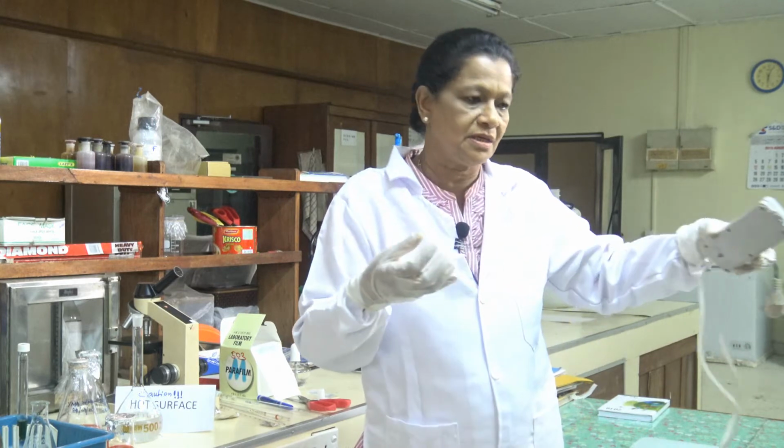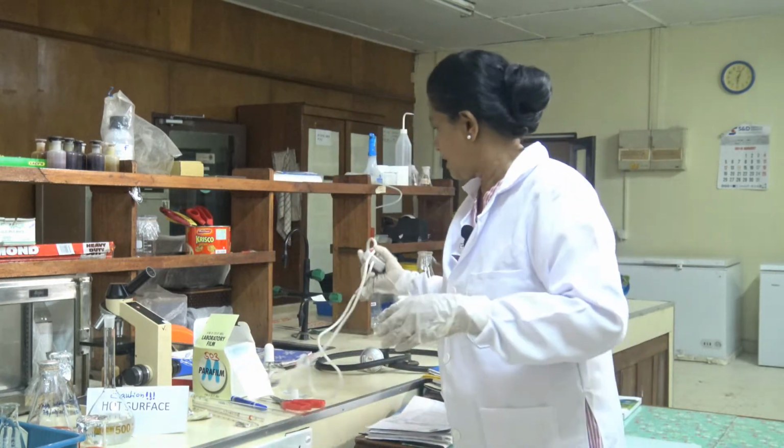Either just dispose of this, or else you can shorten the extension cord by fixing a new plug end. And another thing, do not try to connect multiple extension cords together to reach your work. Just get the exact length of the cable and get your work done.